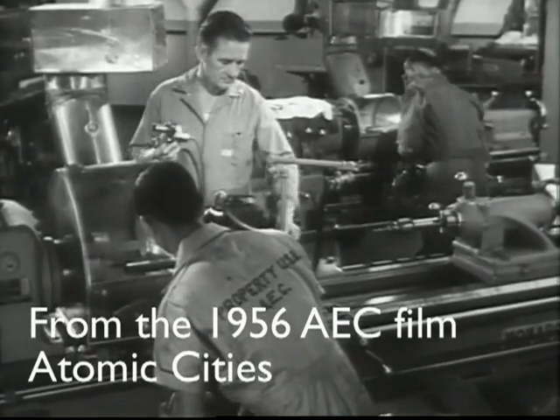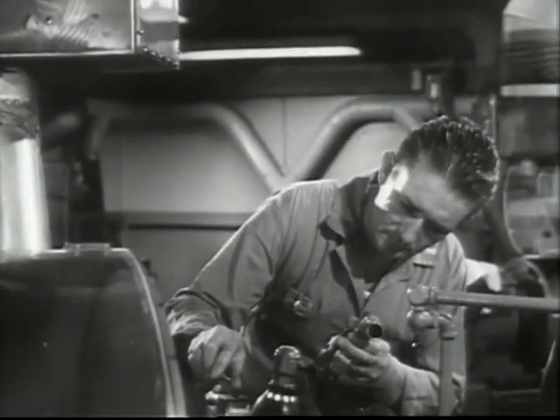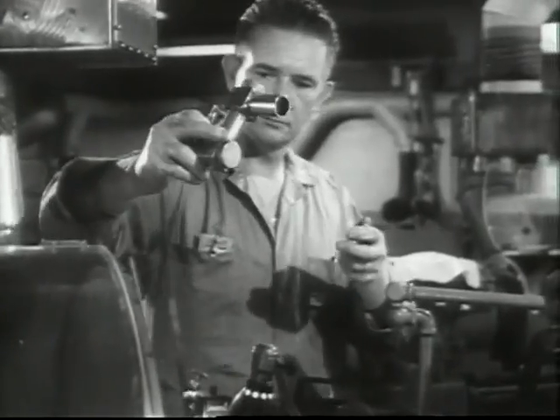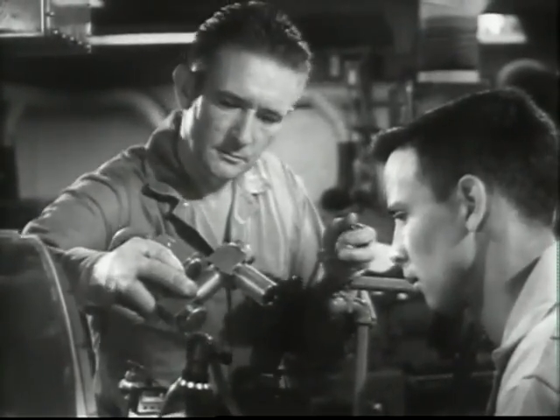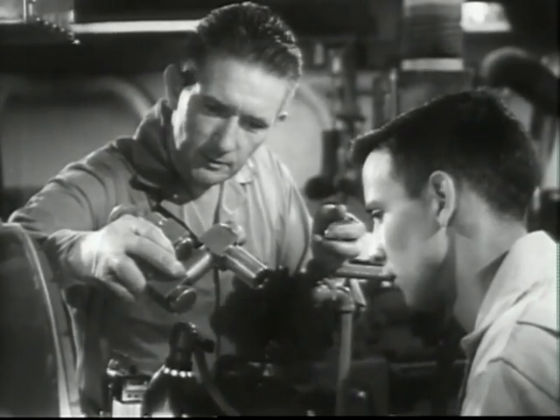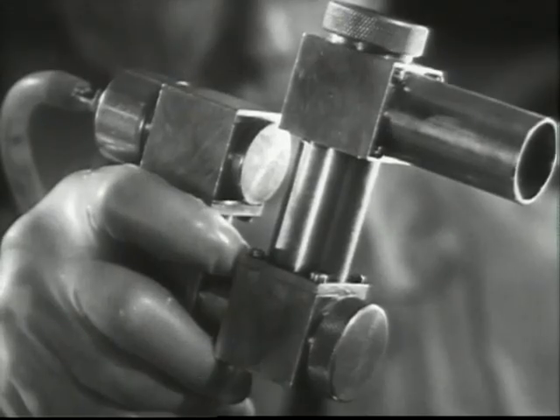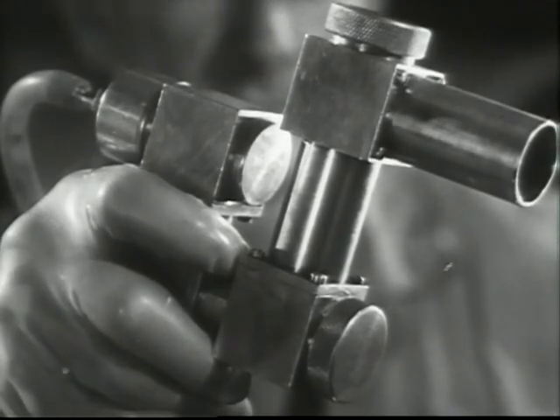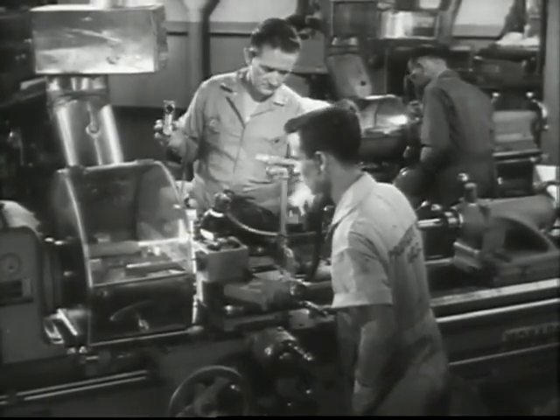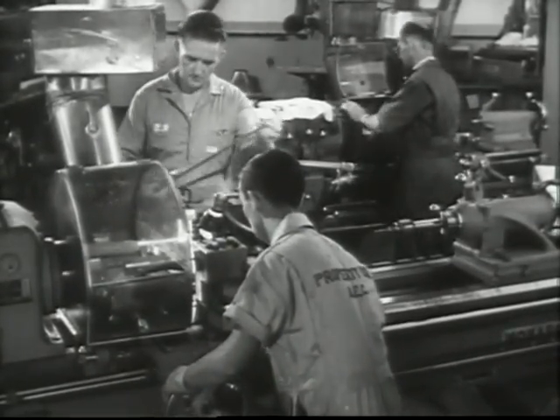This man is a lathe operator working on uranium. A hygiene engineer is about to take a sample of the dust in his vicinity. The instrument he is using is called a cascade impactor. An amazing thing about this device is the fact that it separates dust by particle size. A glass slide in the instrument has an adhesive surface to which the dust sticks. Such samples are taken at regular intervals in all places where there is any chance that the dust in the air may be radioactive.